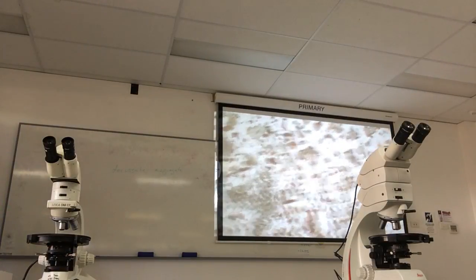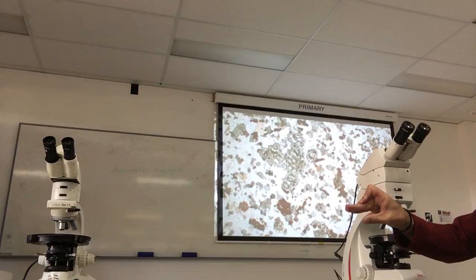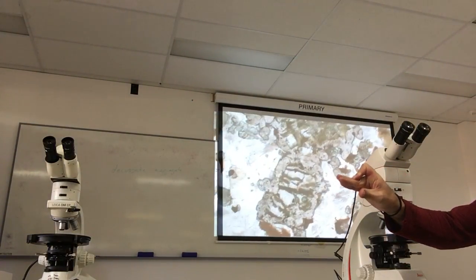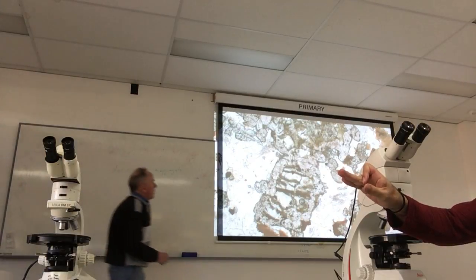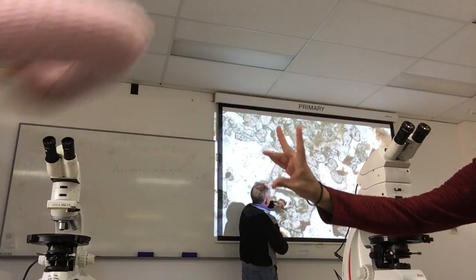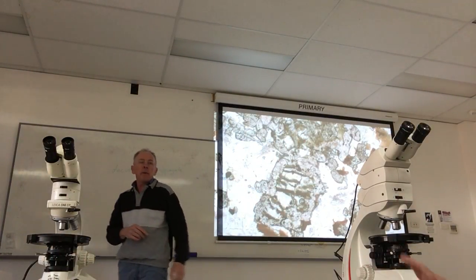Because they're not particularly happy, olivines. They've actually reacted with the melt. So over that relationship there, with the orthopyroxene growing around the outside of the olivine, so this is OPX. You can see the pinkish colour there, this is olivine. The olivine doesn't look happy at all. It's not a happy chappy.